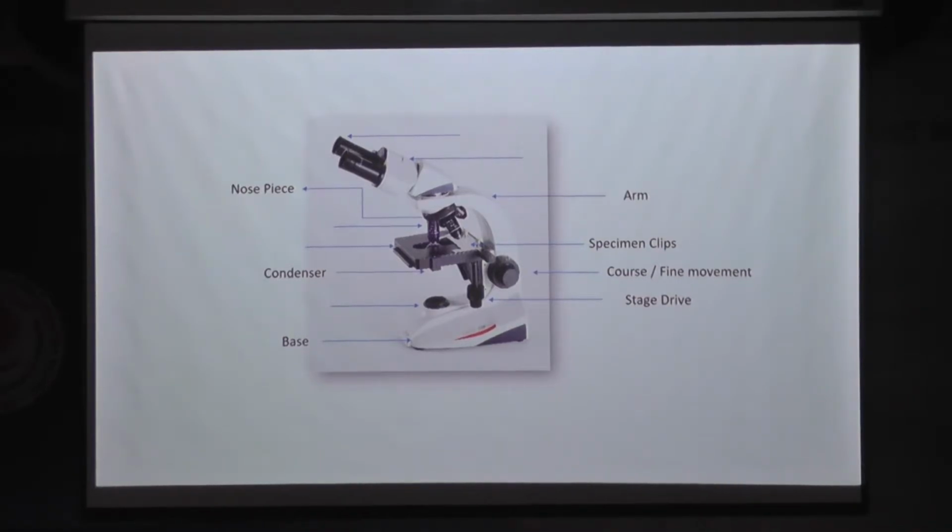There are a few other things, like how an eyepiece will be different in different microscopes. Sir also asked us to discuss the parameters based on which we need to select the parts of the complete microscope. When we talk about eyepieces, there are different fields of view you can have with a particular eyepiece. Some eyepieces will give you an 18 field of view, some will give you 20, 22, 25. There are ranges, so based on this you also need to figure out which microscope will be useful and what the field of view should be.